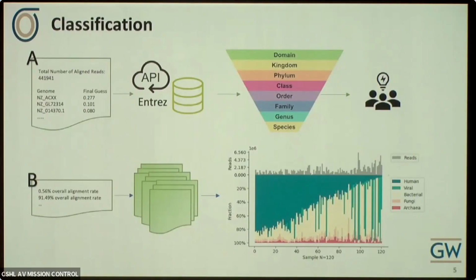The first one is, if we have the abundance table, we want to do some taxonomy profiling. One thing we can do is use NCBI's official API called Entrez to do the mapping. But I suffered a lot because it has so many limitations. You can only request 3 times per second or 10 times per second, so it never ends. So in the end, I thought, why not build my own reference database, which contains all the bacteria IDs, bacteria names, and all of their information, which gives you a quicker and easier answer in the end.